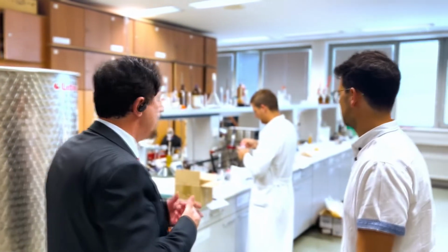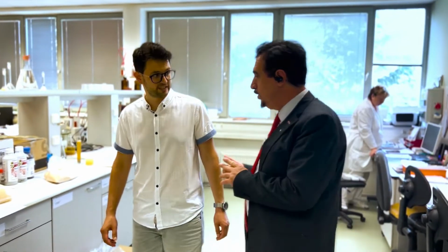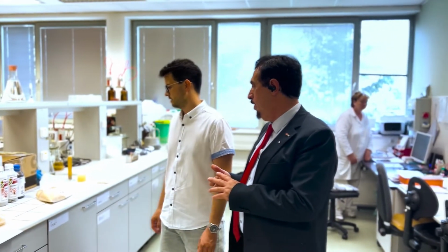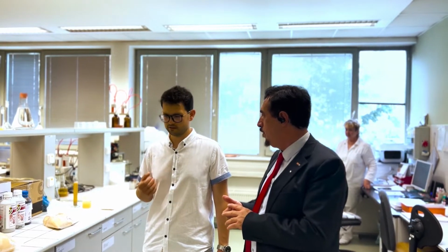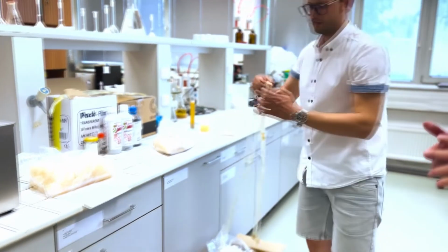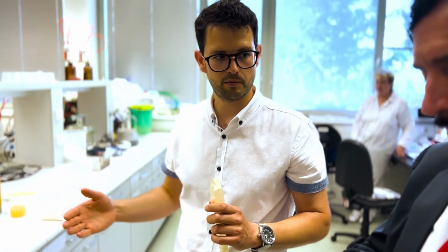Recycling is a very broad field. Could be anything in the world, any materials. But here the specialty is organic waste materials. So you can explain what are the wastes that you are working with now. Basically, in our research, we focus on processing of proteins. We have currently a project aimed at solving industrial waste from sausage casings manufacture. It is a factory which produces casings for sausages, and during this manufacture, at several stages, protein waste is produced.